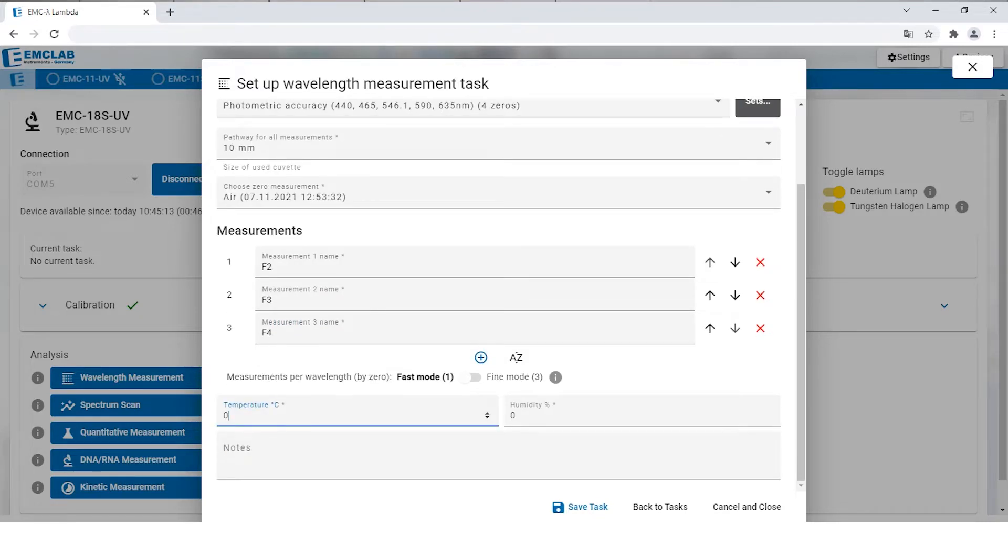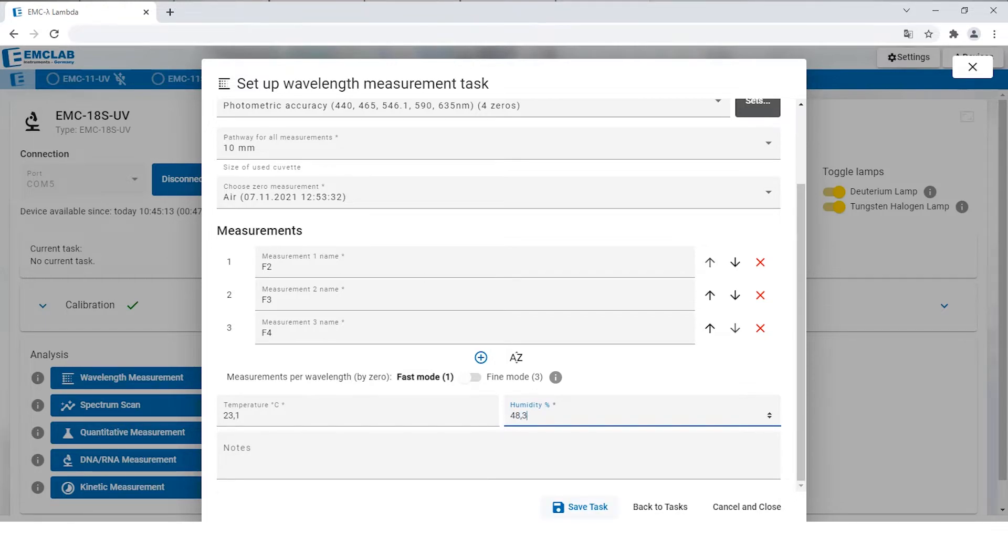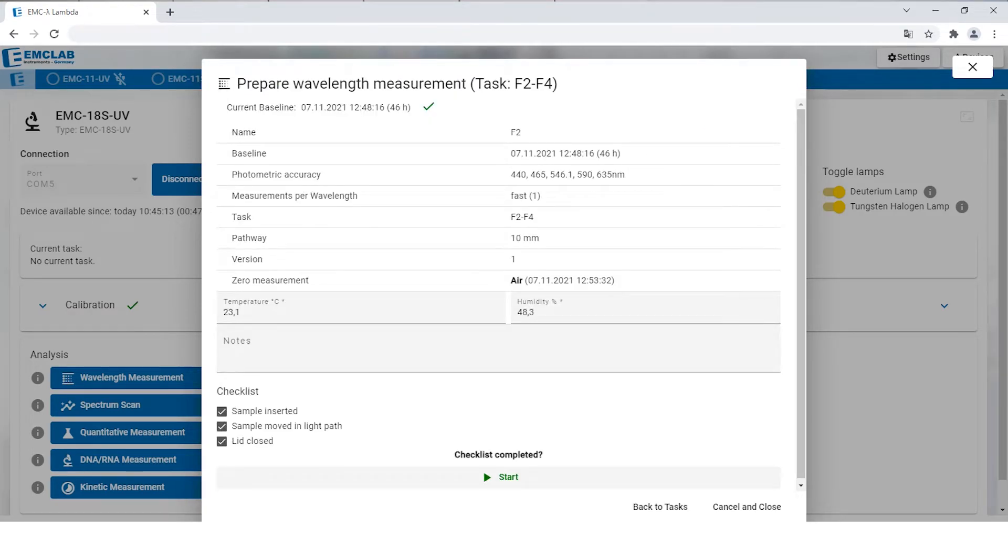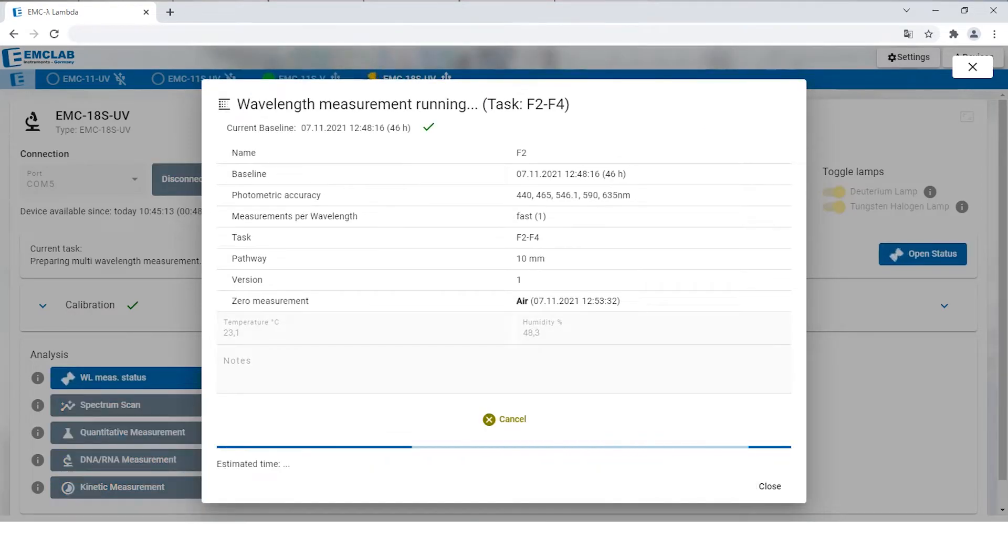Then you insert all the needed information. After everything is entered, you can start the measurement. A separate window will pop up and now you are able to see how long the scan will approximately take.